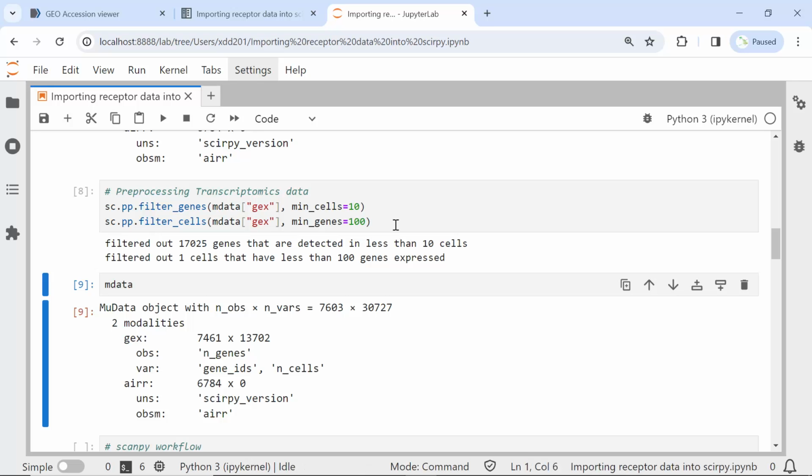If you know the Scanpy package well, you can also plot the violin plot and subset the data according to the total count in each cell and the gene numbers in each cell. In Scanpy quality control, we also calculate the percentage of mitochondrial genes, but in this dataset, if you look at the genes in the gene files, we don't have mitochondrial gene information. So you don't need to perform the mitochondrial percentage analysis.